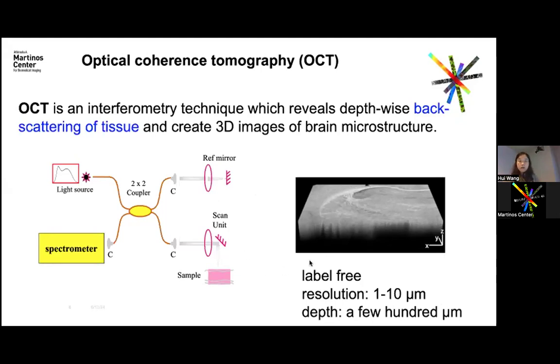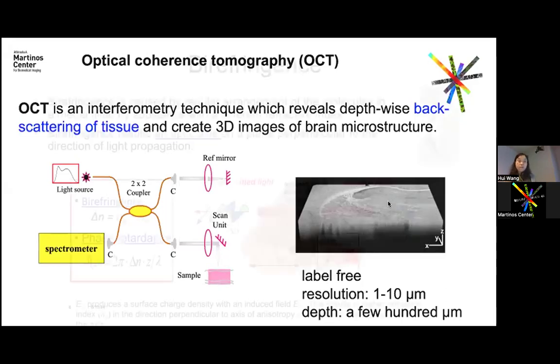So it's good to see that with the OCT, it can see the gross anatomy of the brain structures like this right brain, but it also has signals from everywhere because the signal is backscatter, everything scatters in the brain tissue. What about the targeted fibers we want to see?